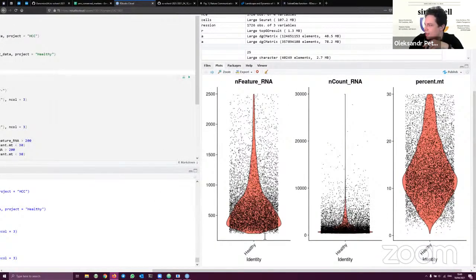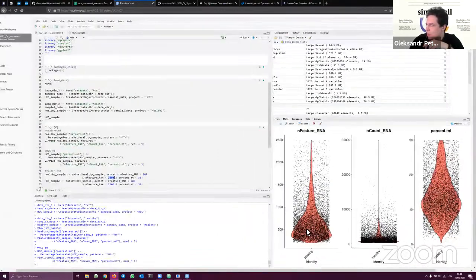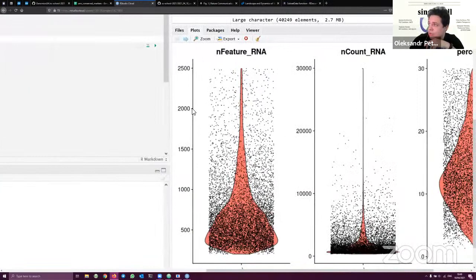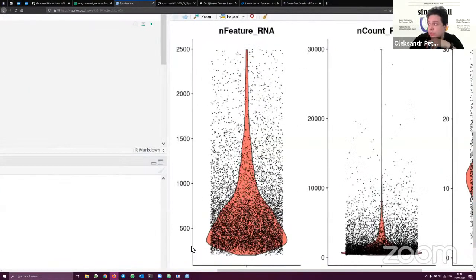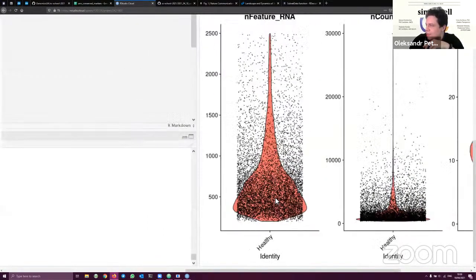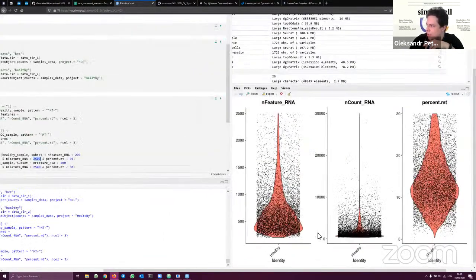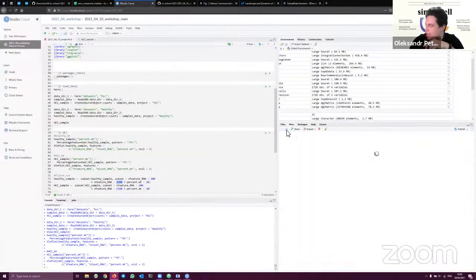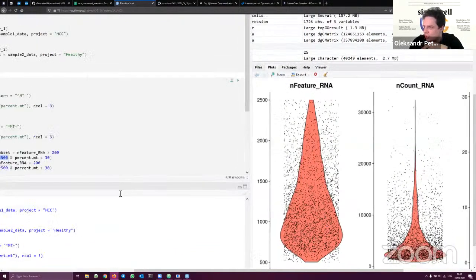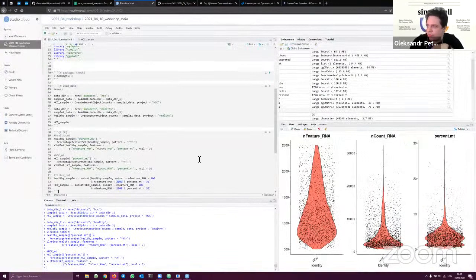insights. Yeah. Actually, what is important, you can see that there are not that many cells higher than 2,000 reads, and unfortunately we don't see the scale, but I think below 200 there are quite a few cells. In this healthy sample, at least, most of them are below 2,000, and in the diseased sample you can see that they're somewhat spread, but again, it's possible to calculate it more precisely. Okay. So we make the filtering.